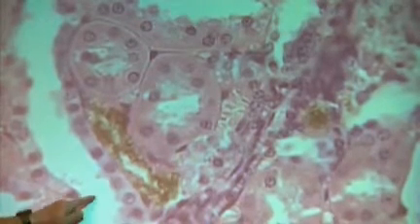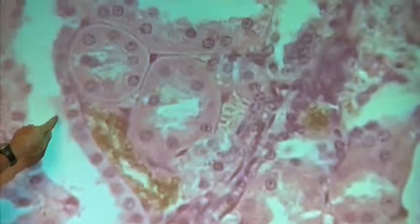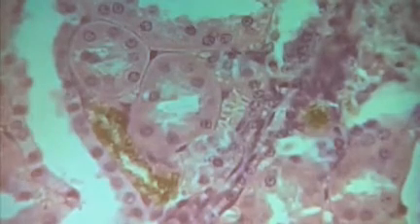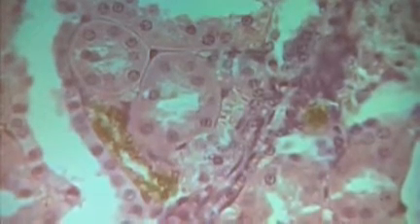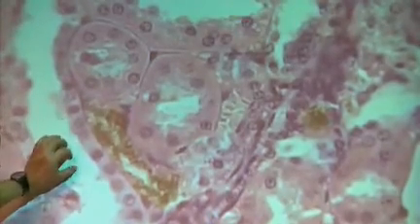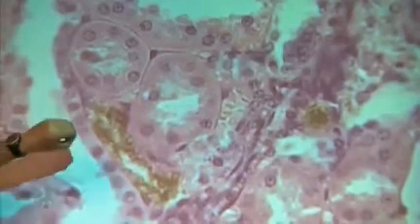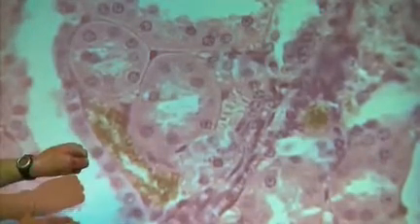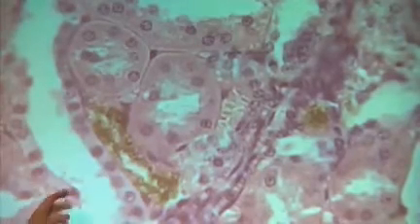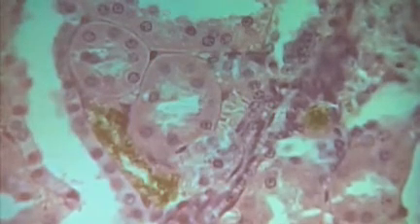All right. Where this one, you see here, hardly anything in that tube, right? And this is a distal convoluted tubule, so it lacks those microvilli. Okay? So, proximal convoluted tubule has microvilli, distal convoluted tubule does not. And I just want to point out that this is a tube cut this way, okay? Where this is a tube cut this way. That's not the difference here. The difference is what's in the middle of the tube. Okay? So I just want to point that out.